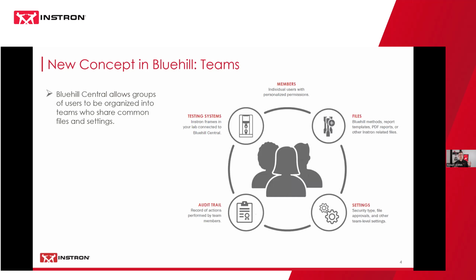So it's a way of grouping your individual members, with each member in a different group having personalized permissions and files, so methods, reports, results, settings. The audit trails are also separated and organized by team, and you want to organize your test systems in your lab itself.